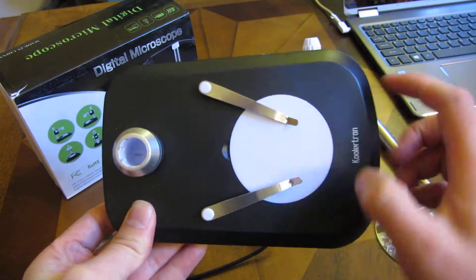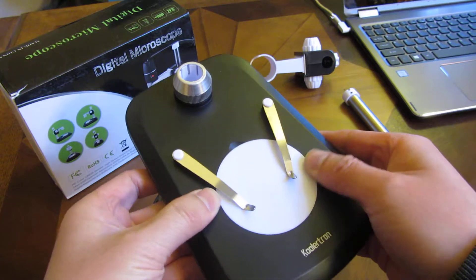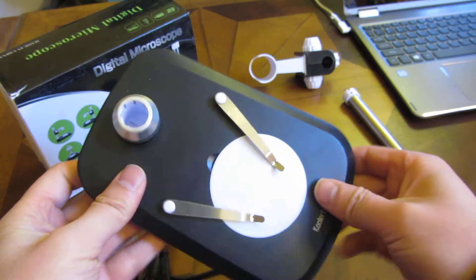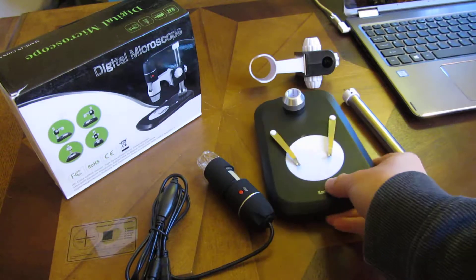It's a plastic base with slide holders. This thing does rotate — as you can see, it rotates. And the base itself is fairly simple.